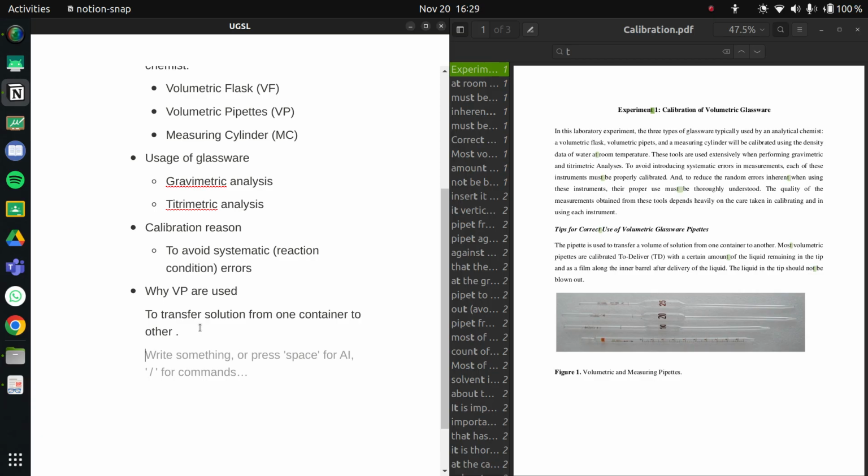Oh, okay, I get it. So it's like whatever amount of liquid actually went out is what was written by the marking. The liquid that is inside plus whatever went outside is the total amount of liquid, but we only measure by the pipette the amount that went outside, which makes perfect sense.